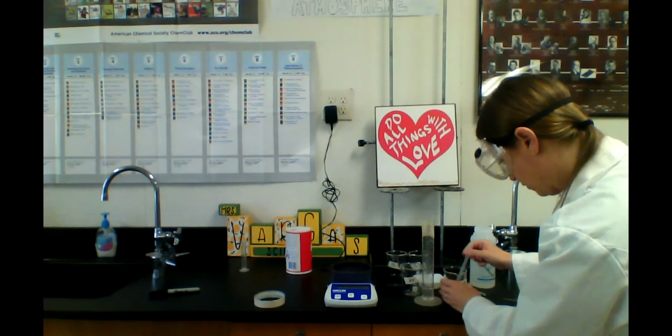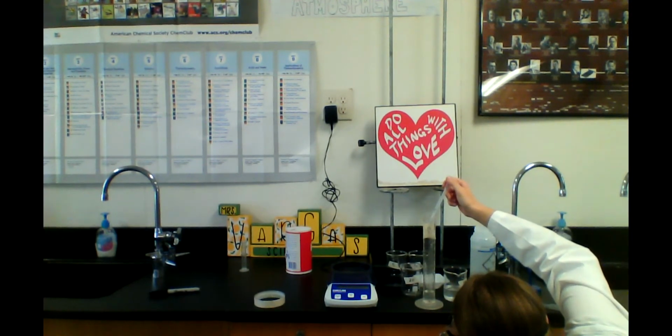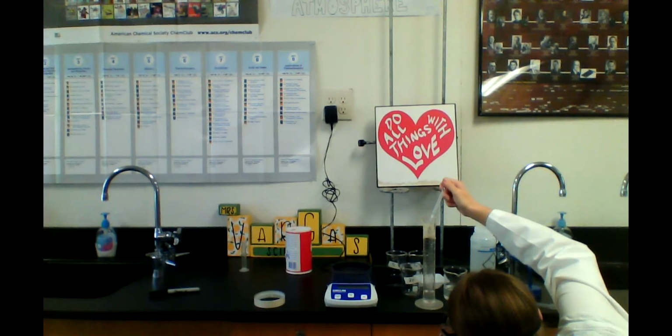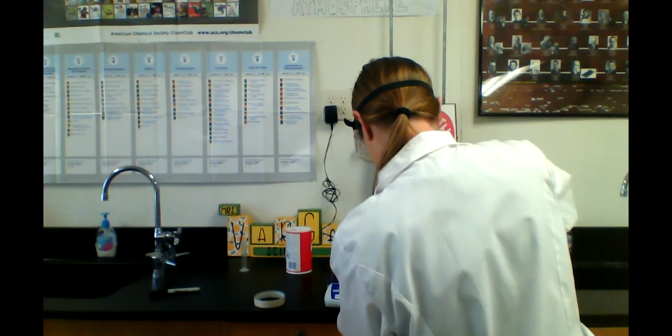Okay, and let's use our clean pipette. Take this out. Clean pipette for that last milliliter, and we don't want to pick that up because that's going to make it uneven. Okay, so we're at 15 and bottom of the meniscus, perfect, at 16 exactly. Put that in here.